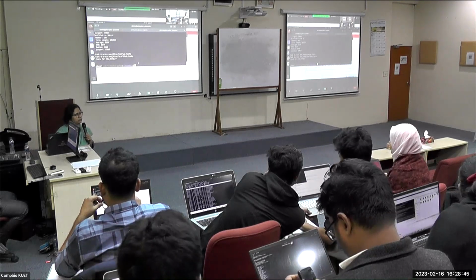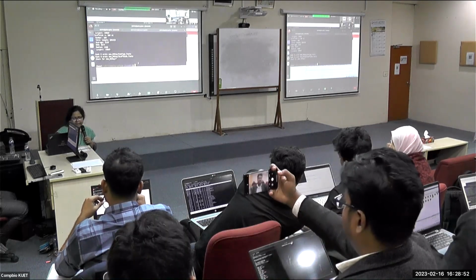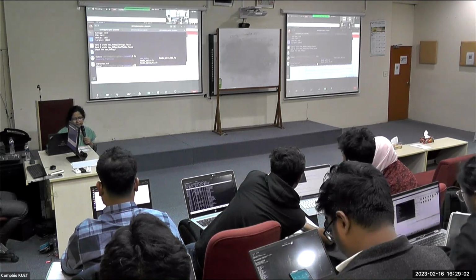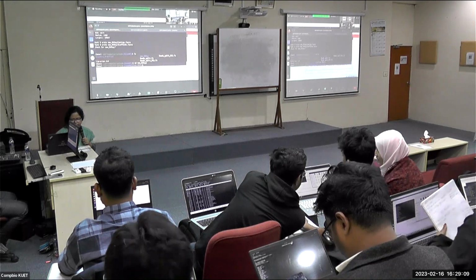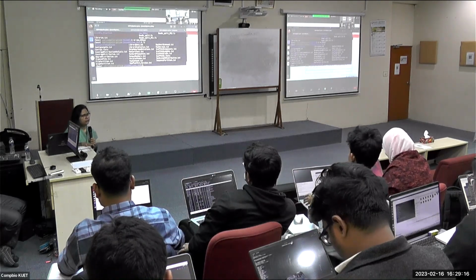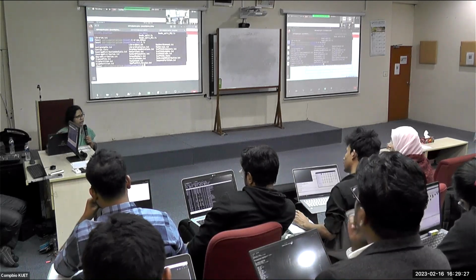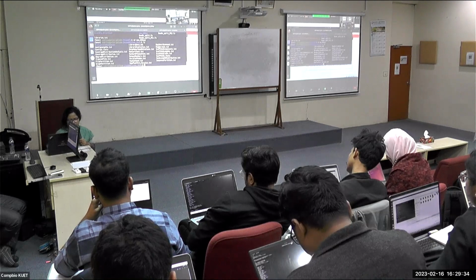How many of you have got it complete? Okay, many of you. So just type ls and see how it looks. It created the new folder, the new empty folder. This was the output. So go inside the output folder and see how many files it has generated. If you want to understand assembly properly, you can go through all the files that are generated and try to understand what they are. But our main concern is the contigs.fasta file and also the scaffolds.fasta file.